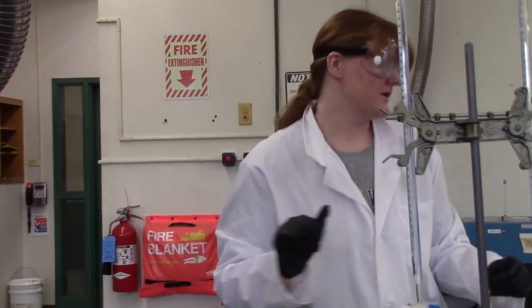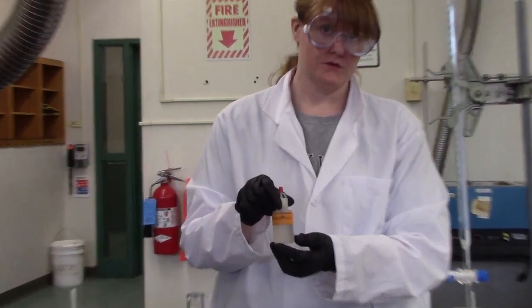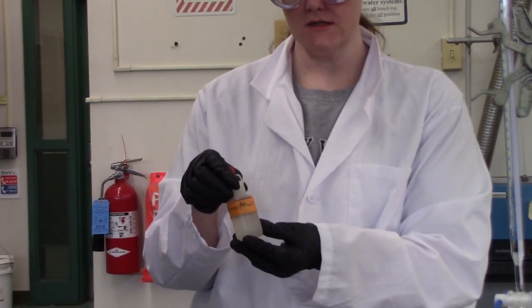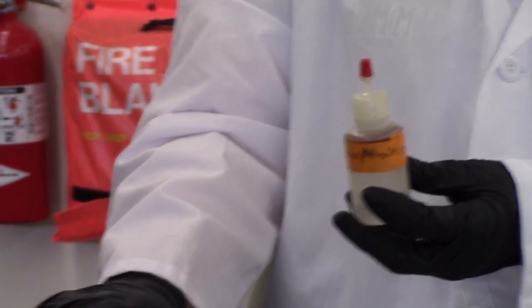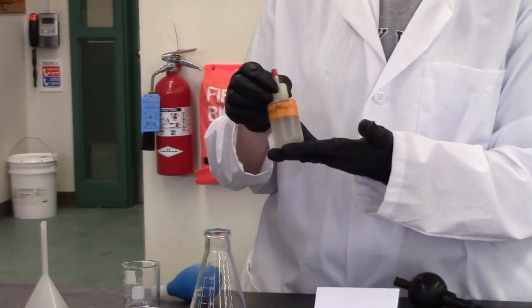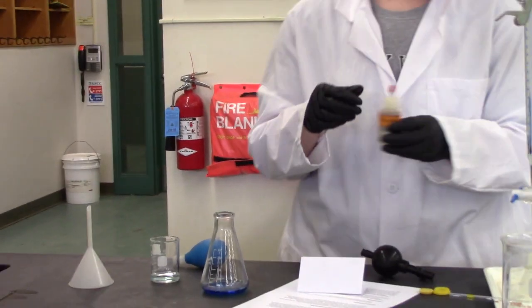Then we're gonna add 2 to 3 drops of phenolphthalein, okay? That's this stuff. I'm gonna say that one more time so you can practice it before we get to lead. It's a tough one, but phenolphthalein. And so phenolphthalein is interesting. It's an indicator that is clear in acidic solution. So when you first put it in here, it's not gonna look like anything. It's just clear, colorless liquid. But as we add base to it, it will eventually turn pink.